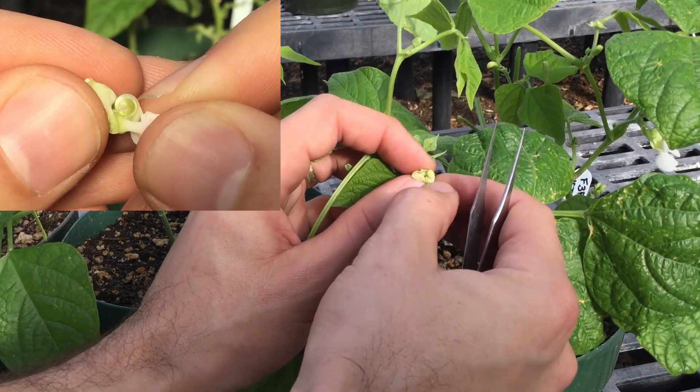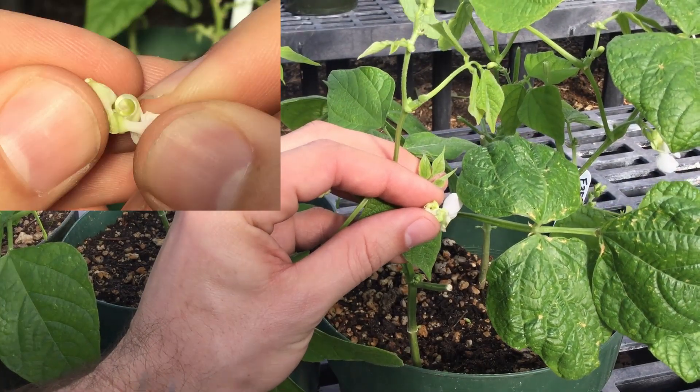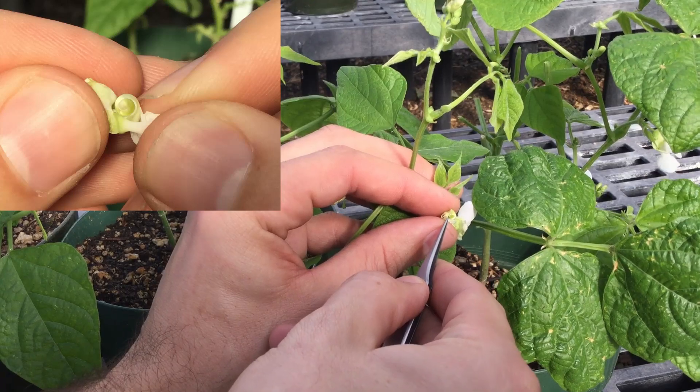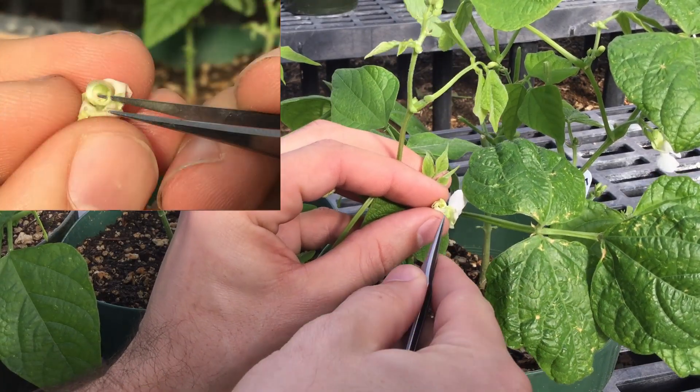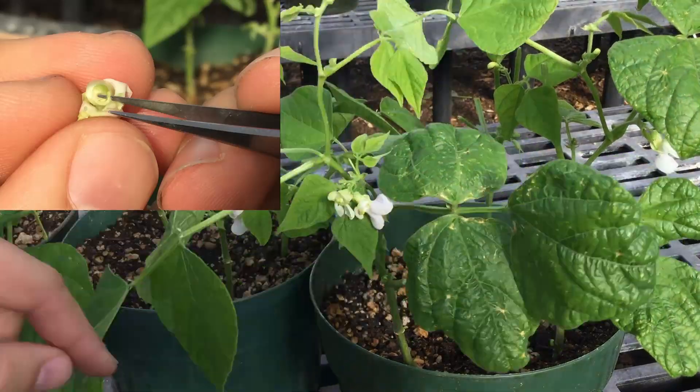That'll make it so the stigma pops out — it can be a little hard to see. It's a really small structure, but there's a little tiny hook in there that has just popped out of this middle, kind of coiled petal. That's what I want to see — just a little tiny stigma that's popped out.